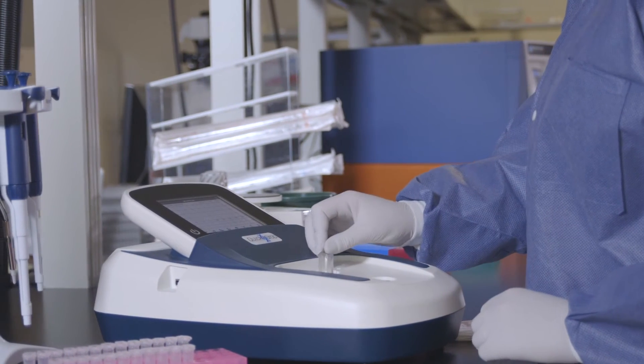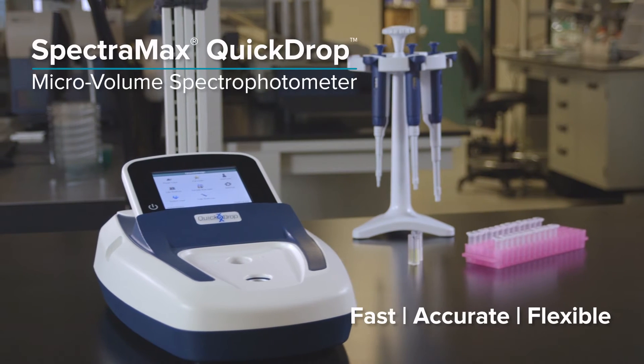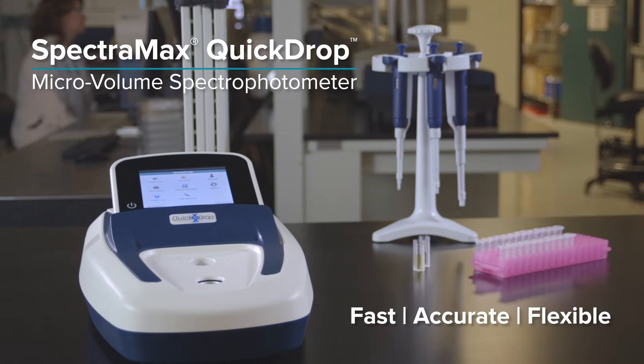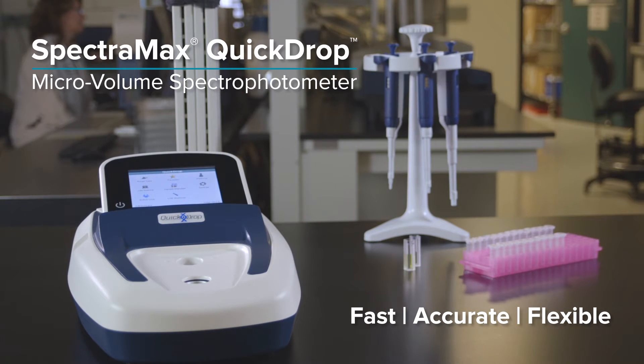A world of information can be pulled from the tiniest drops for those who know how to look. Introducing the SpectraMax QuickDrop micro-volume spectrophotometer, setting new standards for speed, accuracy, and flexibility in an affordable spectrophotometer.